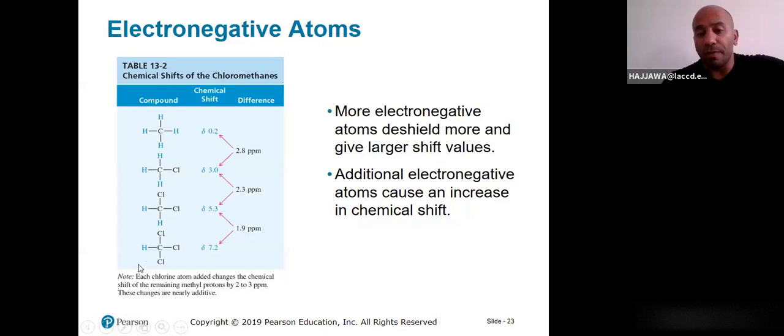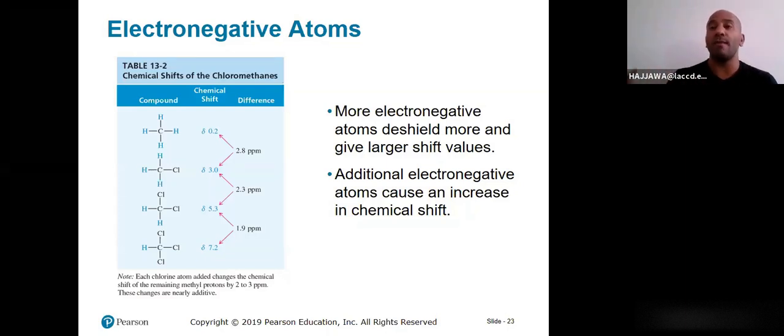For the chloroform case, you will see it reading at 7.2. Most of the time we use chloroform as a solvent along with the TMS as a reference. So if I run an NMR sample using chloroform with TMS in it, I would expect to see the peaks that belong to the molecule, a peak at 7.2 ppm for the chloroform, and the 0 ppm peak for the TMS.